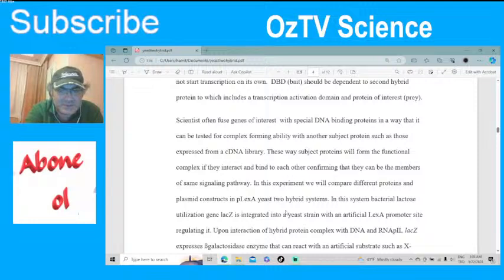This way subject proteins will form a functional complex if they interact and bind to each other, confirming that they can be members of the same signaling pathway.